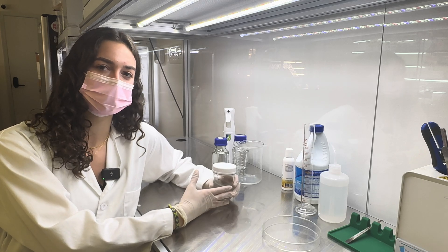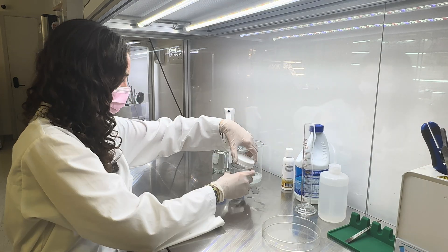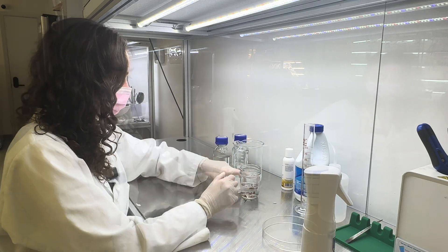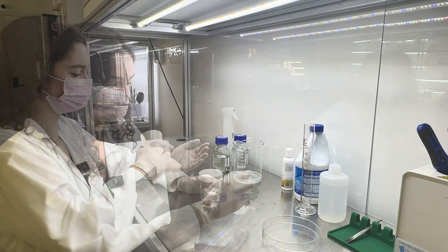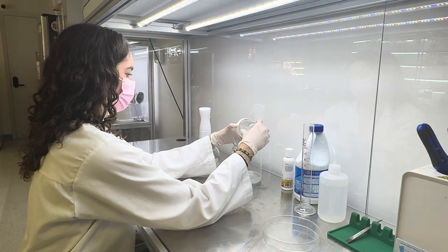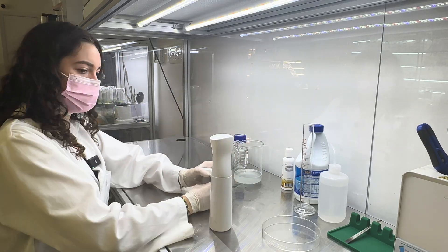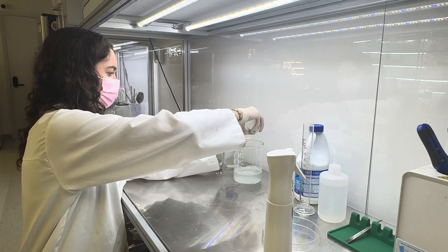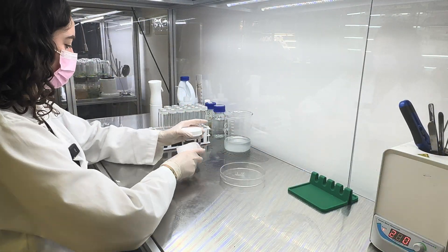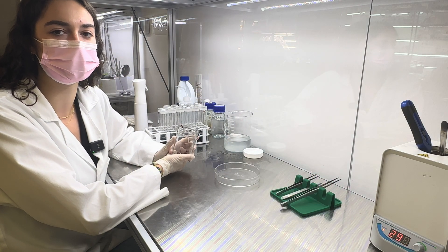After the 15 minutes are up, I'll pour out my bleach solution and rinse with sterilized distilled water. Now I'll rinse three times, five minutes each. Now that the third rinse is done, I'm going to cut the ends of the plants before I add them to the media.